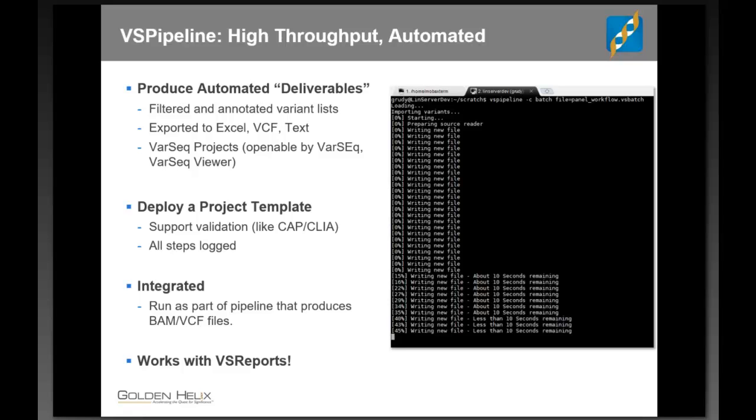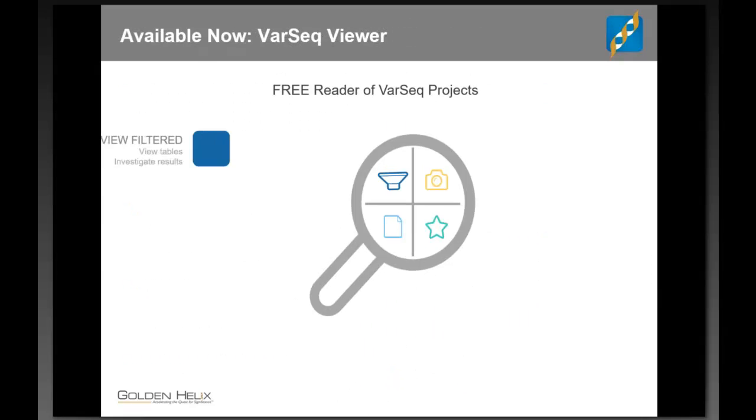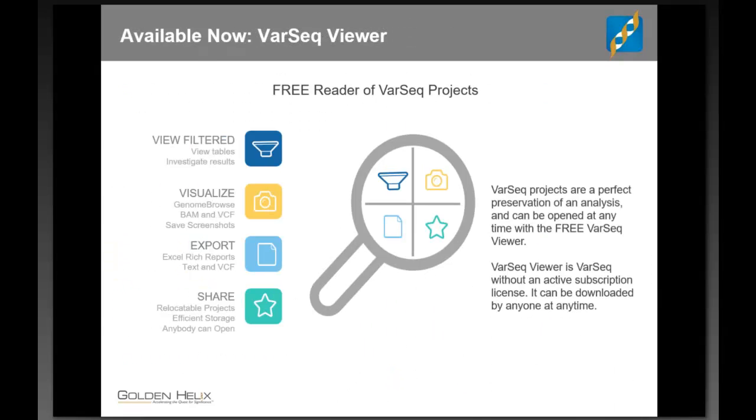And the project itself may be the final result, because those projects can be viewed by anybody who has VarSeq, and in fact it can be viewed by anybody who has VarSeq Viewer, which you can get for free from our website.